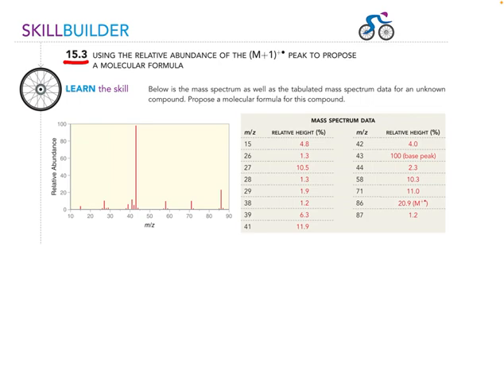Last time we saw how to determine the number of carbon atoms in your compound using the relative abundance of the parent peak and then the m+1 peak. So we're going to use that. We'll also use a couple of other tools in our toolbox to try to figure out the molecular formula.